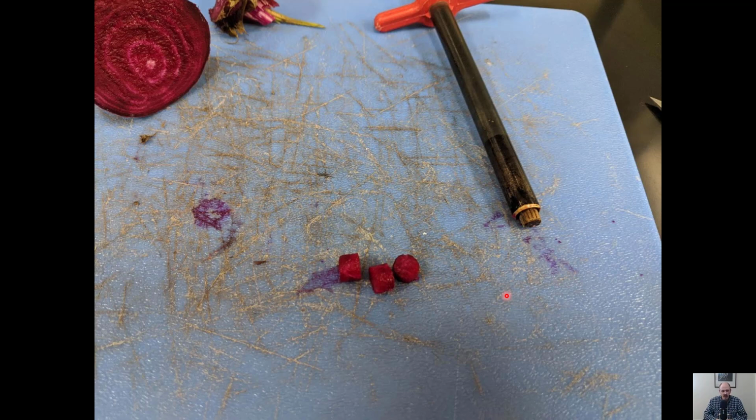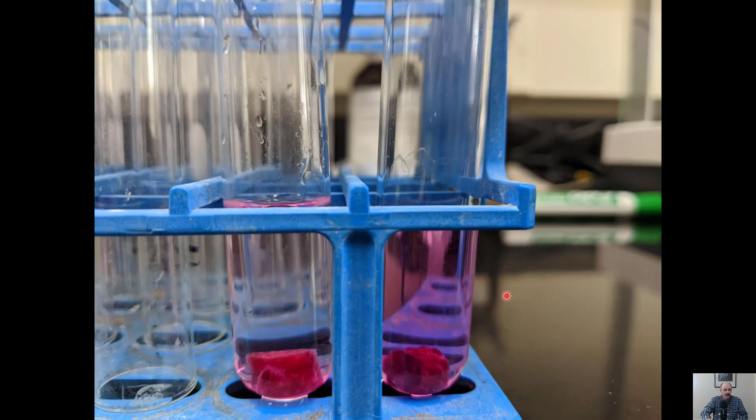You're going to rinse off those discs under cool water to get rid of the betacyanin that leaked out when you cut them. And you're going to plop them into your ethanol solutions and let them incubate. That means sit there for 5 minutes. There is an example incubation table in your manual that you can use if you want, which will help you keep track of when beets went into the alcohol and when they have to come out. And you let them sit there for 5 minutes.